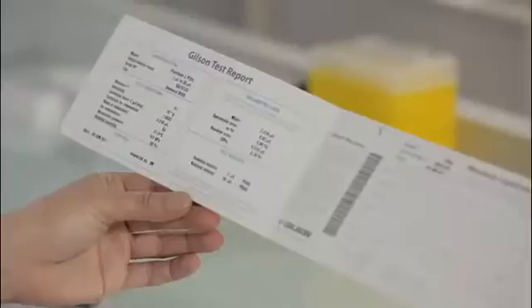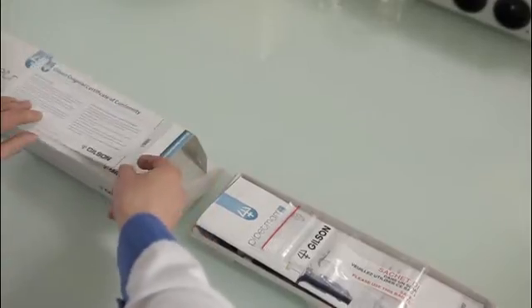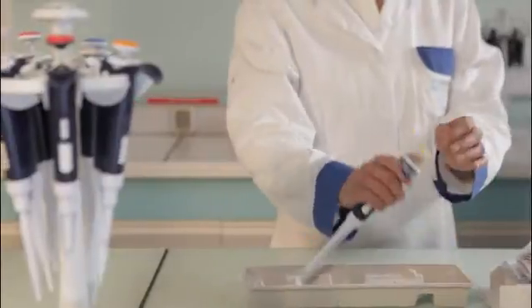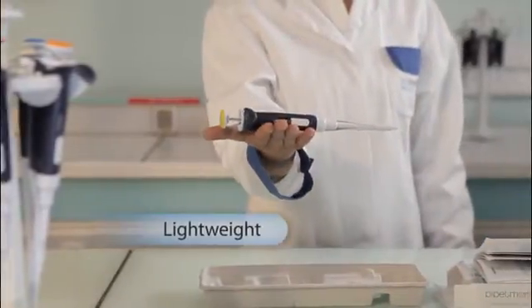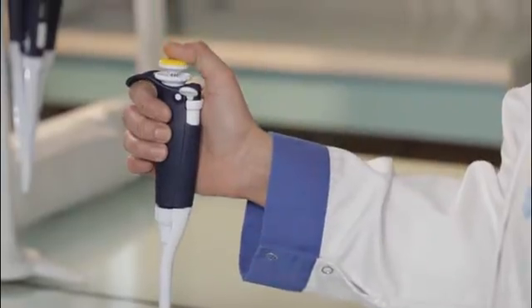The PipetMan L is delivered with its original Certificate of Conformity to ensure the highest precision and accuracy. According to ergonomics experts, PipetMan L weight is ideal to achieve the right balance between comfort and lightness.